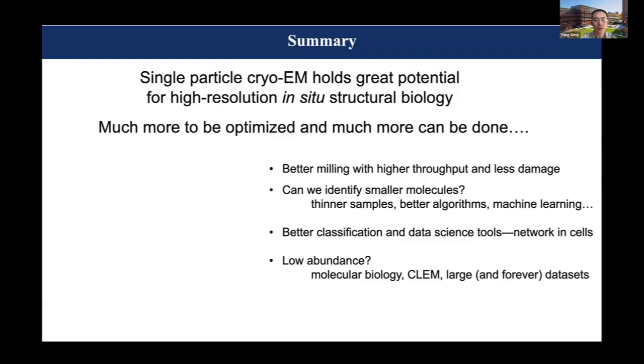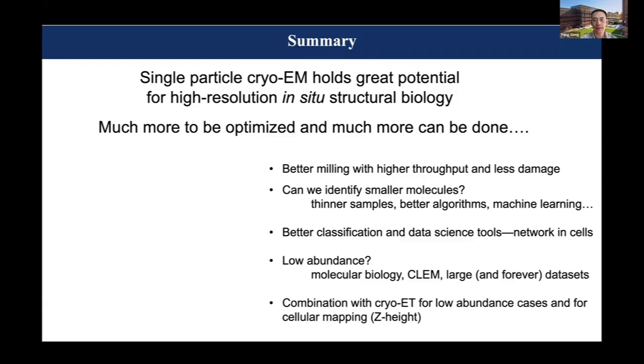But in the end, what I really want to emphasize is that this is not just a standalone technique. What's best is to combine this with cryo-ET. Cryo-ET, even though it's hard to do, has unique strengths that single particle just cannot overcome.